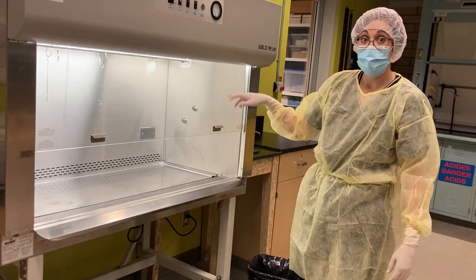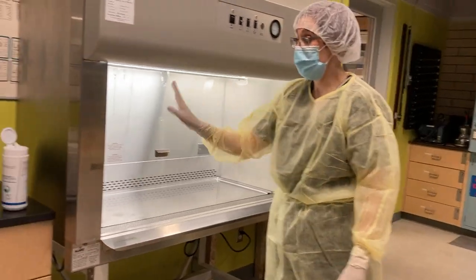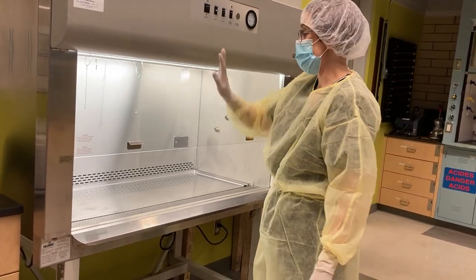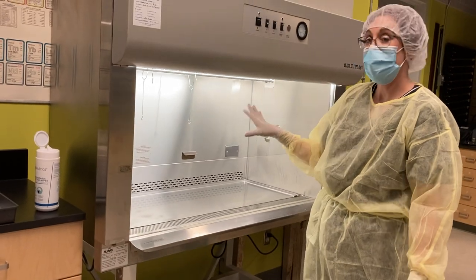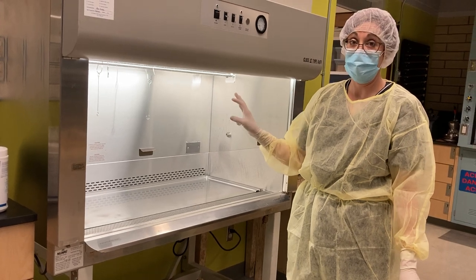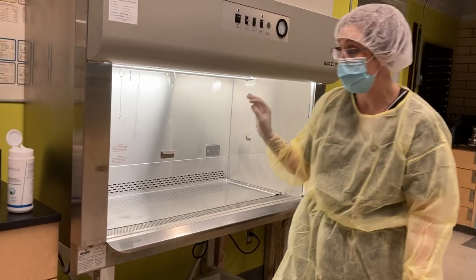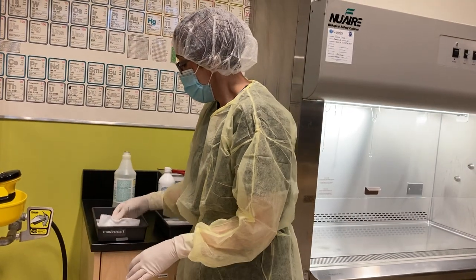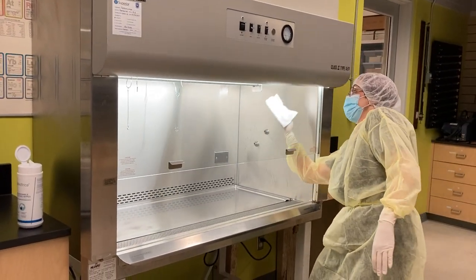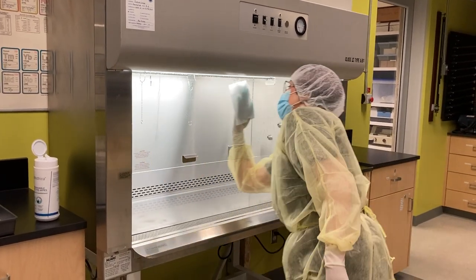If the outside of your PEC viewing window is dirty, you would do another wipe with a germicidal agent. Again, method A, going side to side, top to bottom. Now, because this viewing window is made of plexiglass, we cannot use alcohol on it. It will cause streaking and make it hard to see through when you're compounding. So in this instance, we would use sterile water for irrigation. And again, using method A, going top to bottom, side to side, with slight overlapping strokes.